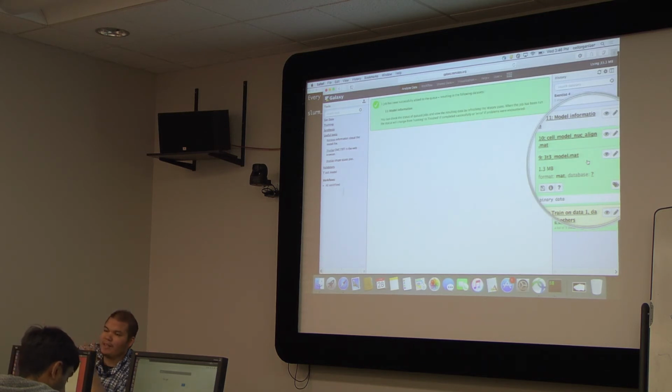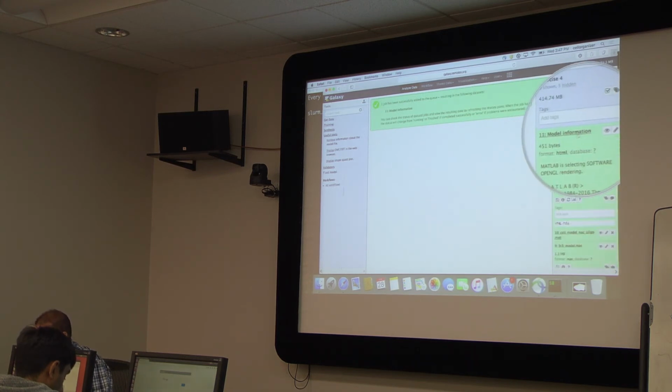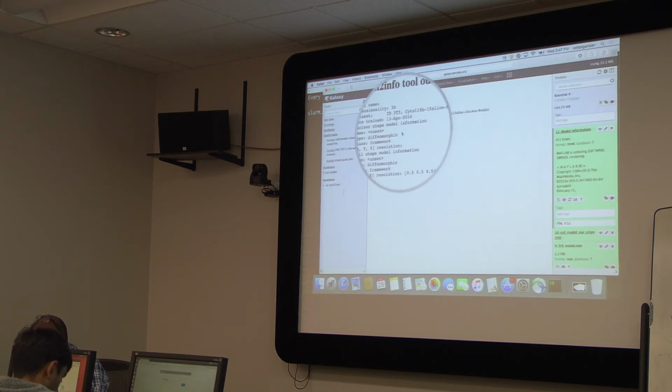If you take a look at these nuclei, they look a little bit too large, but this is an estimation of what he thought was the nuclei. So again, this is the model, a model trained by Greg, 3D3, 3 years ago.